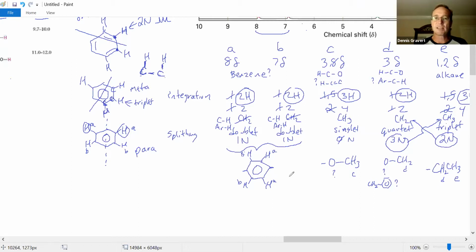Wait a minute, that's the other thing. How many carbons do we have? The molecule C10H12O2. I got 6 C's here. I got 1 more there. I got 1 more there, and I got 2 here. So 6, 7, 8, 9, 10. Good, I got all my carbons. So if I want to attach a double bond, right? 6, 7, 8, 9. Oh, I double counted. D is already here. Oops. Oops, glad I caught it.